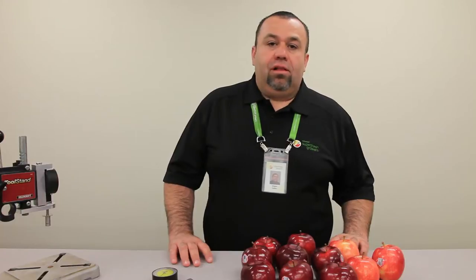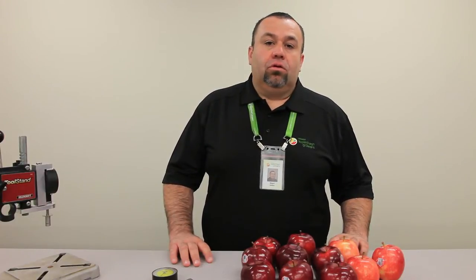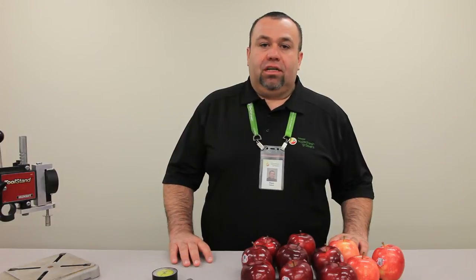This is Miguel Gomez, Quality Assurance Manager at Domex Superfresh Growers, and today we're going to go over the proper way of pressure testing apples.